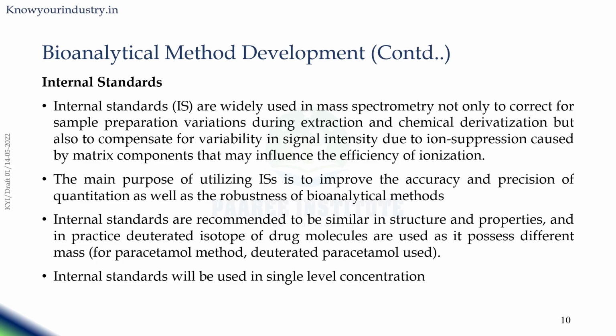Internal standards are recommended to be similar in structure and properties, and in practice a deuterated isotope of the drug molecule is used. In the case of paracetamol, we take deuterated paracetamol as the internal standard, where the chemical nature of the drug remains the same. This isotope-based internal standard possesses a different mass, so the physical nature is different and the mass will be different, but the chemical nature of the compound remains the same, so that it will behave similarly. Internal standards will be used at a single-level concentration.